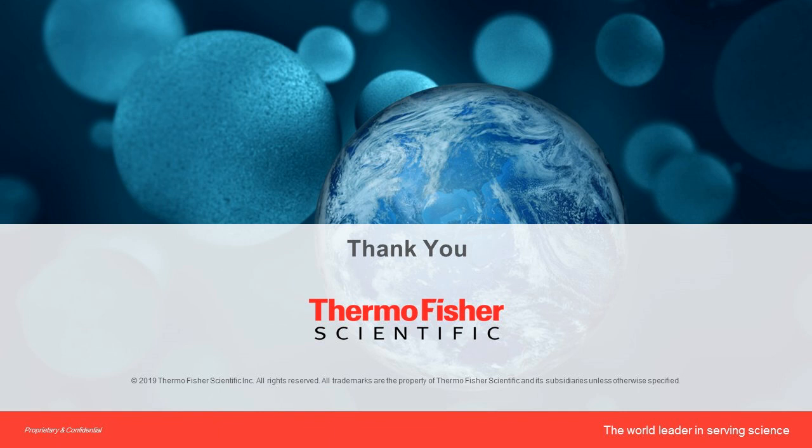Okay, so this may be a question for both of you. Have either your products been used for cell therapy endpoints such as removal of lenti or retroviruses from CAR T culture? So I guess I'll start off. We don't currently have a commercially available kit for retro. However, we are in the process of developing that actually through an FDA grant. So hopefully by early 2020, we should have that available. And once it is, it could be used for mAb processes, CAR T processes, any process that needs to demonstrate the removal of a retro particle.